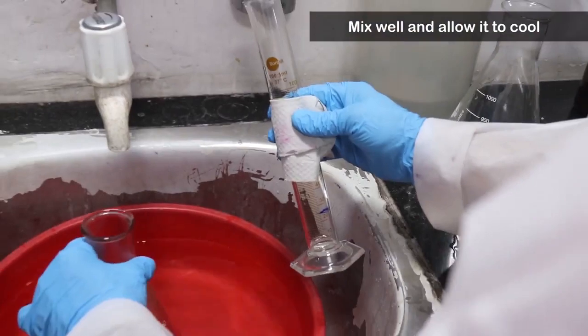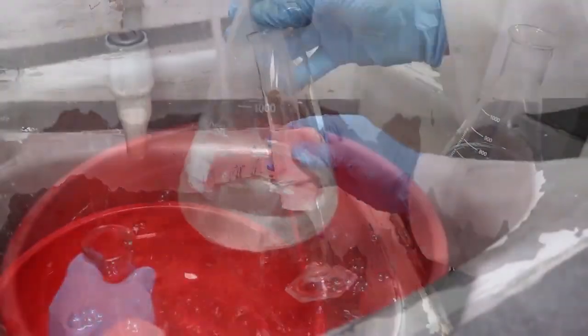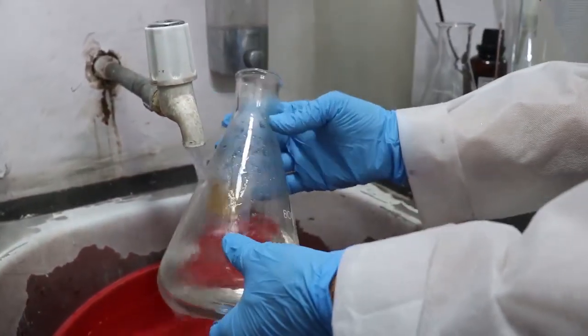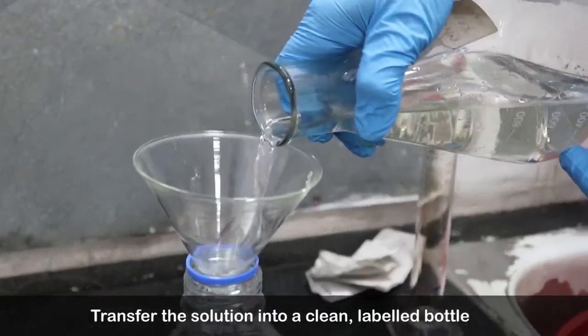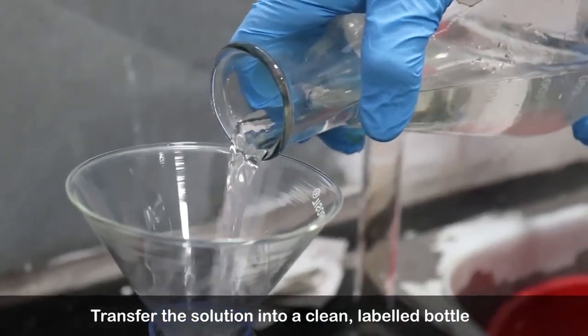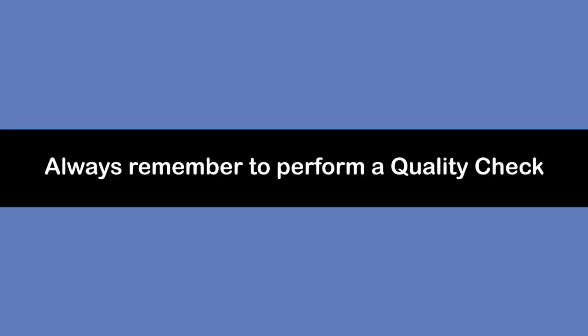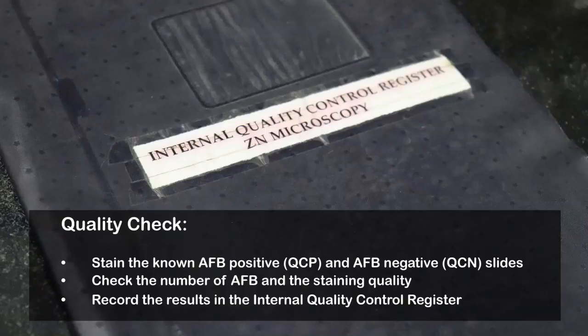Mix well and allow it to cool. Transfer the solution into a clean labelled bottle. Always remember to perform a quality check on every new batch of reagents.